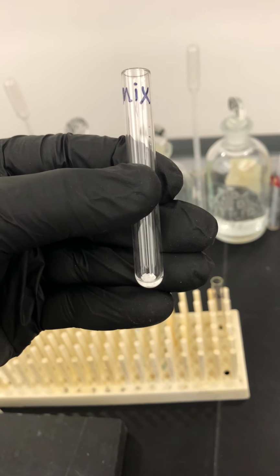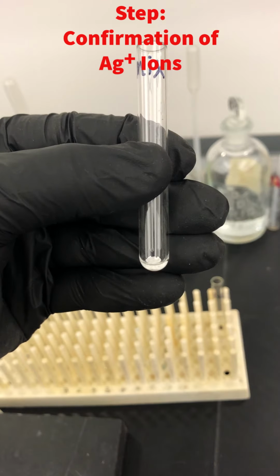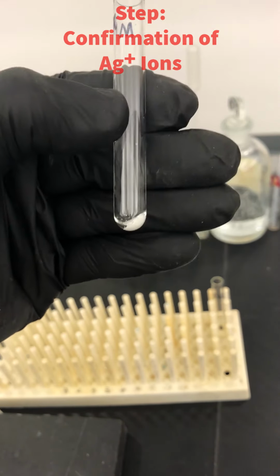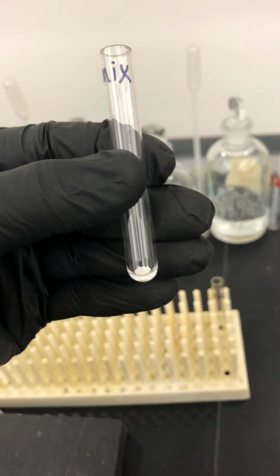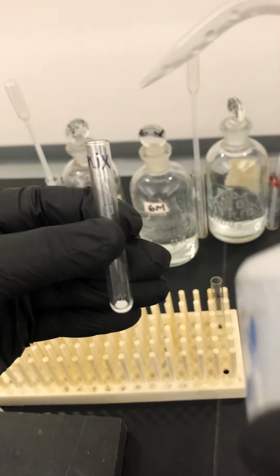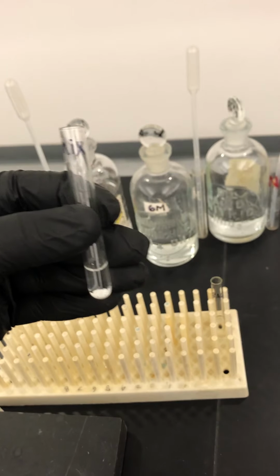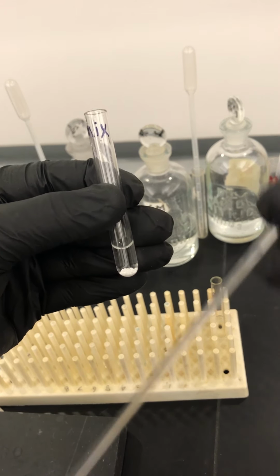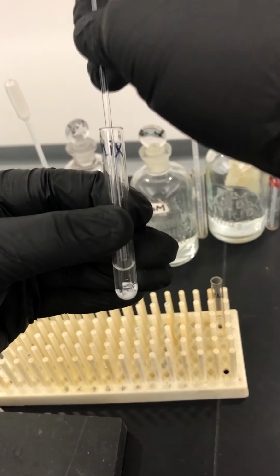Remember that in our first step, we had precipitated silver chloride and we had a pellet that we washed with water just to get rid of any residual iron 3 and copper 2 ions. So this should be essentially silver chloride. What I'm going to do is resuspend it. I'm going to bring in my distilled water bottle, add some water in there, and once more use one of these little mini stir rods to stir it and mix it up a bit.